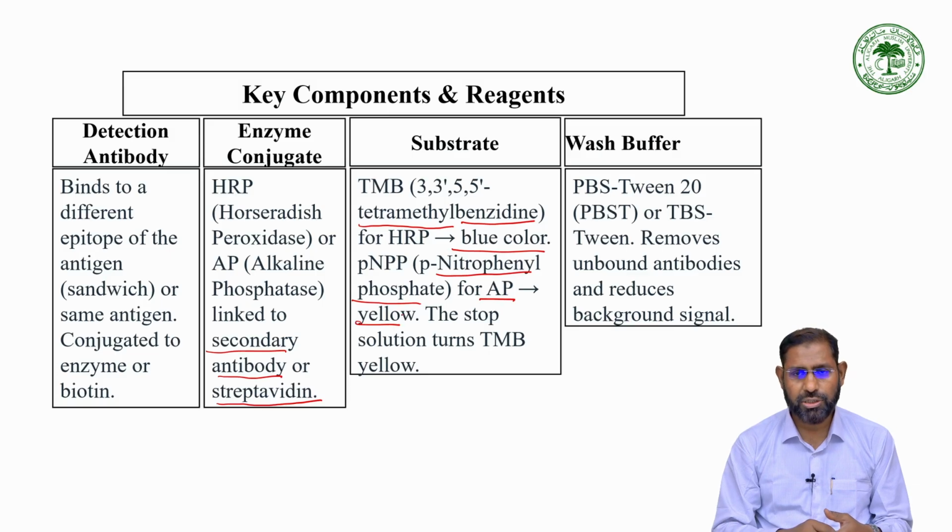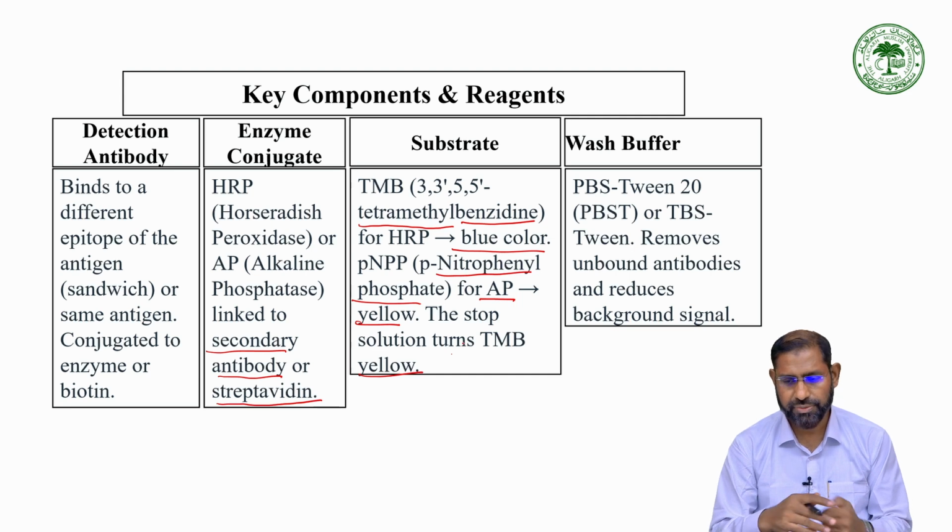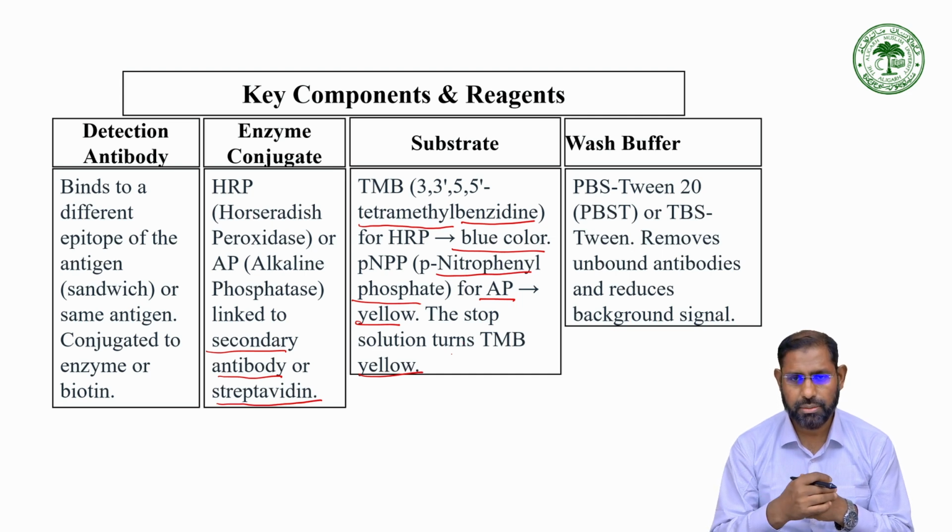When we add the stop solution, the blue turns to yellow. This is sulfuric acid. We add this to stop the reaction, and the color changes from blue to yellow.